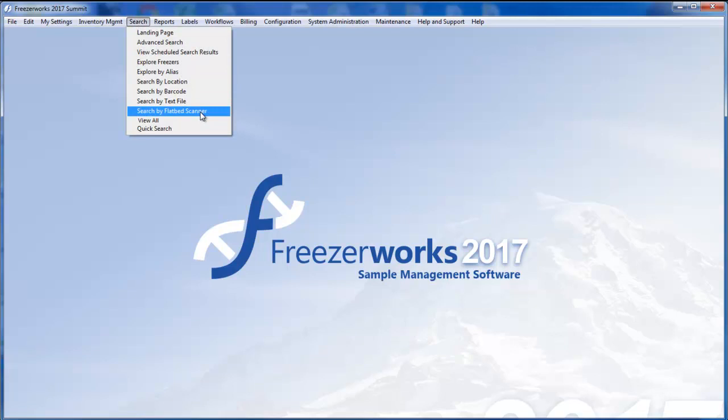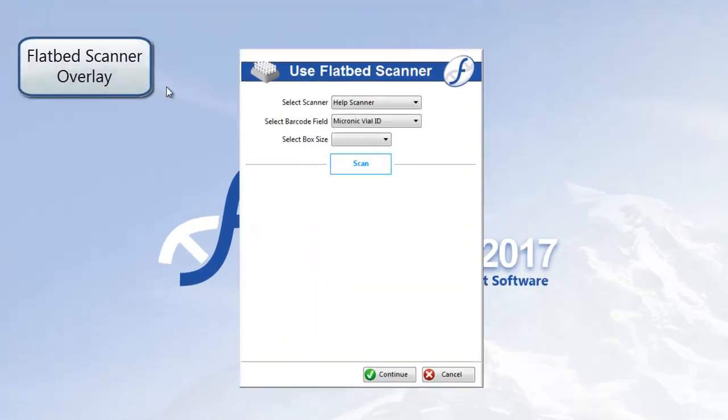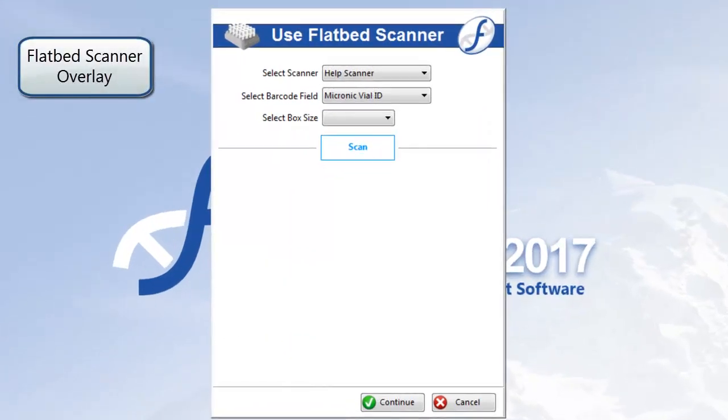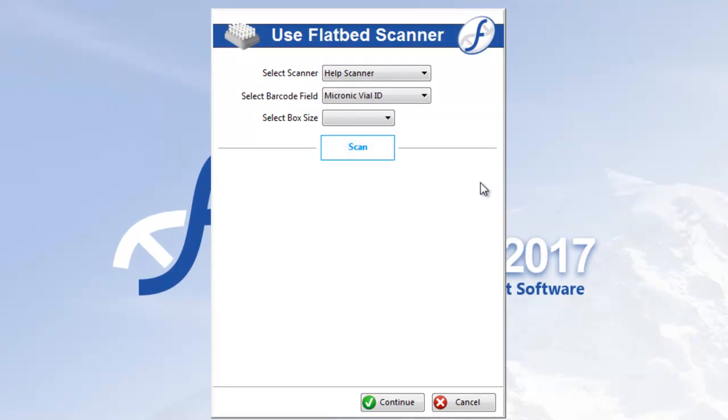We'll open this and I'll show you how the flatbed scanner overlay works, as this is the generic tool used for all flatbed scanning activities in the FreezerWorks desktop client.